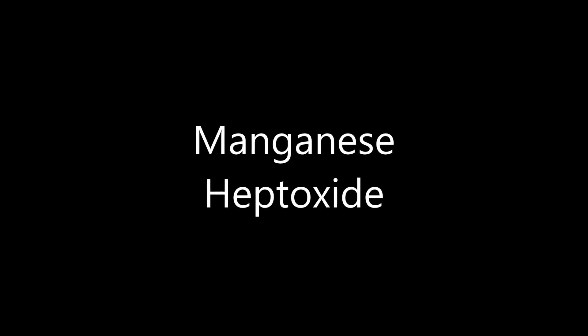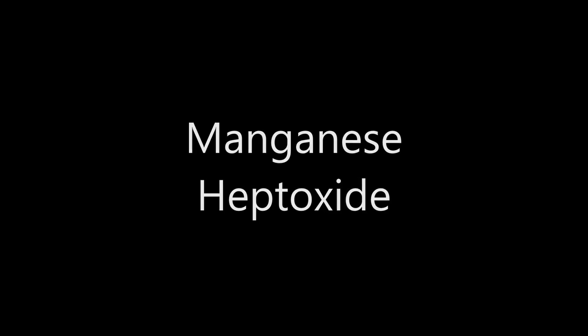Hello, and welcome to another episode of But Preston Did It. Today, I will be preparing manganese heptoxide.